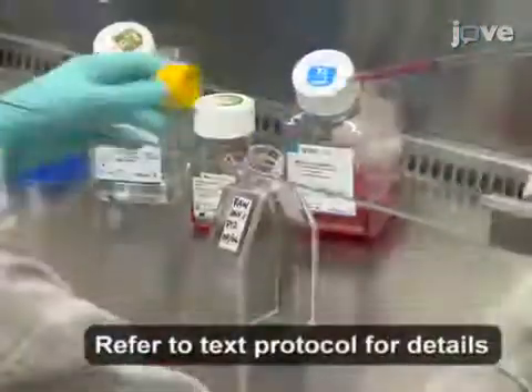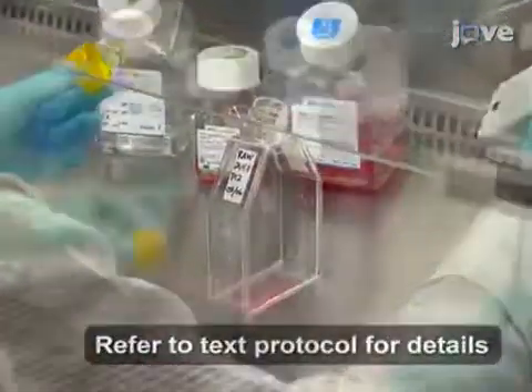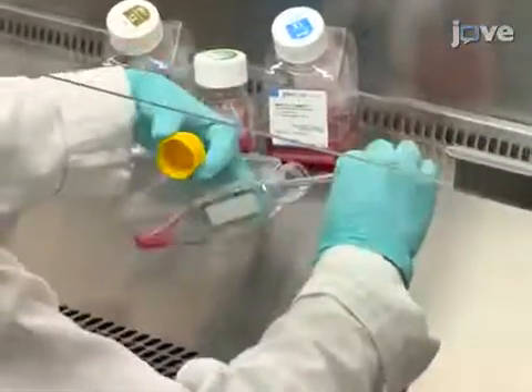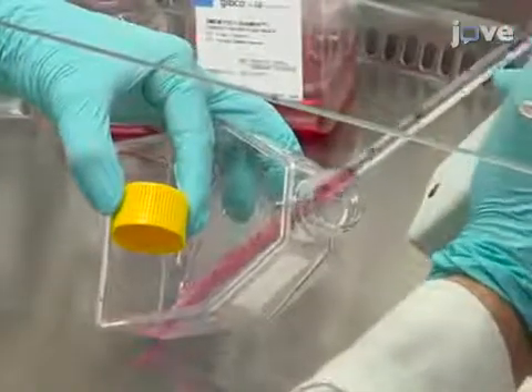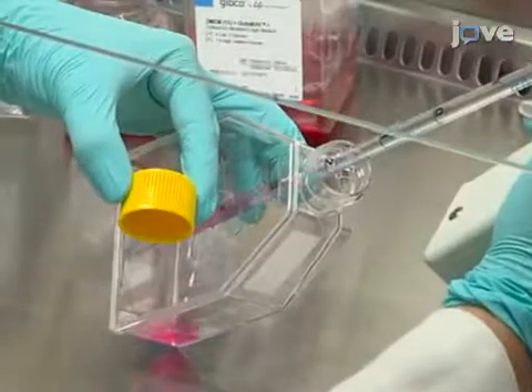After washing RAW 264.7 cells, add 1 ml of the warm trypsin solution to the dish and dislodge the cells from the bottom of a tissue culture vessel by scraping. Then collect the cells and make a single cell suspension by repeated pipetting.